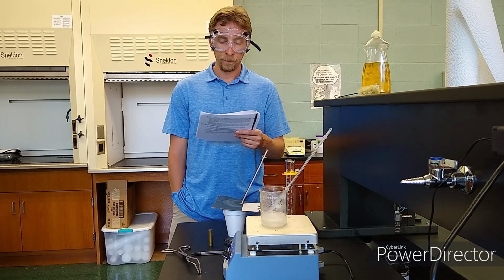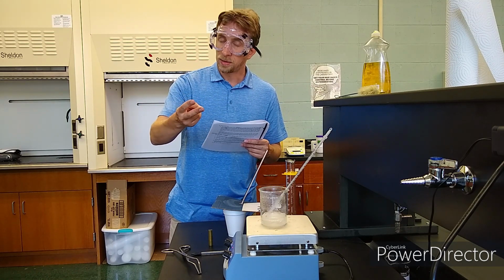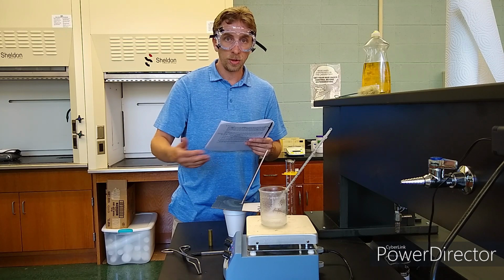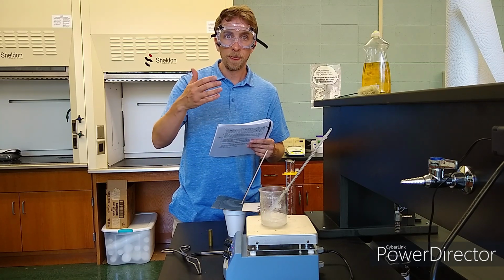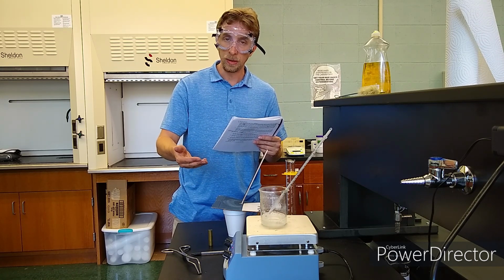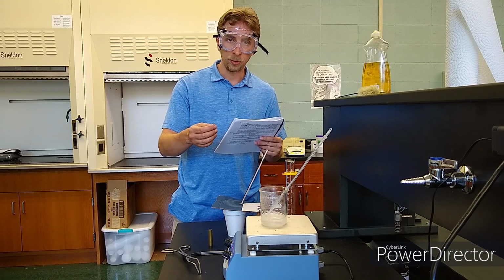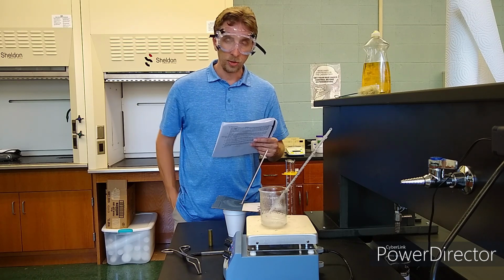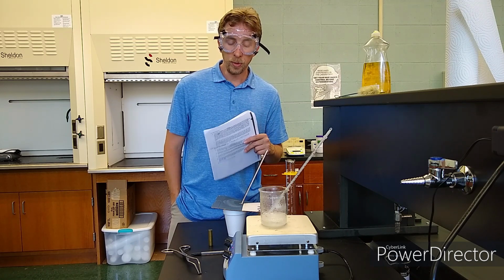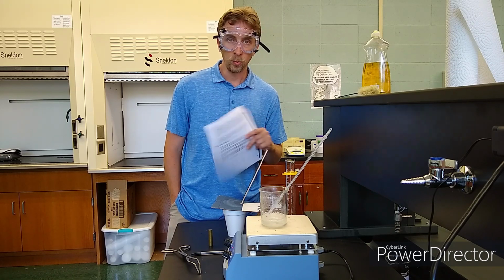Now, in the regular lab meetings, you'd be required to do at least 2 trials. Either repeat with the same metal or do a second metal of a different type and see if you get good results for that second metal. So what I'm going to do is a second metal real quick here, see if I get good results for that one, and give you guys the results from the second metal trial, and you can do the calculations for the second trial as well. Now I'm going to put this into fast motion for you so you don't have to watch every single thing as slow as we did for this first trial. So let's get to it.